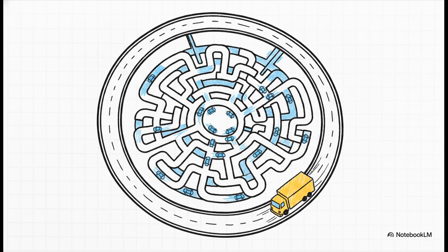The large macromolecules, they're like massive transport trucks. They're way too big to fit down the narrow side streets, so they're forced to use the highway bypass around the city. And because they bypass all those tiny streets, they move much faster and exit the column first. The smaller molecules, on the other hand, are like little cars. They can turn down every tiny alley and side street. Because they explore all these small paths, they get delayed and take much longer to exit. It's an incredibly elegant, purely physical method of separation based entirely on size.